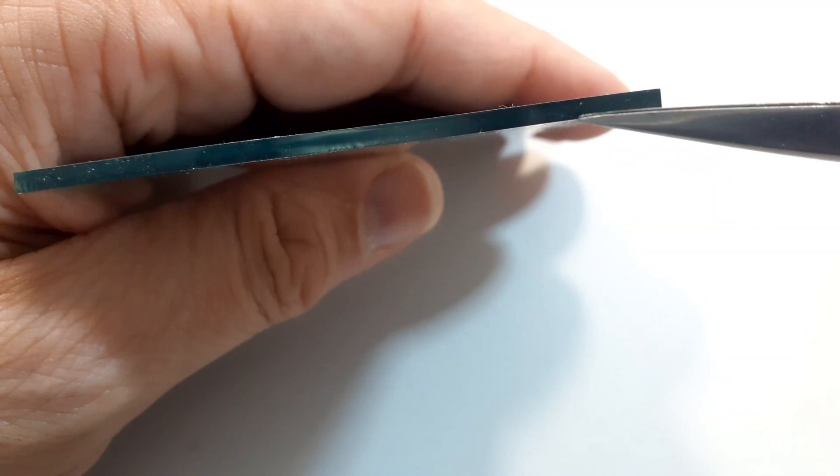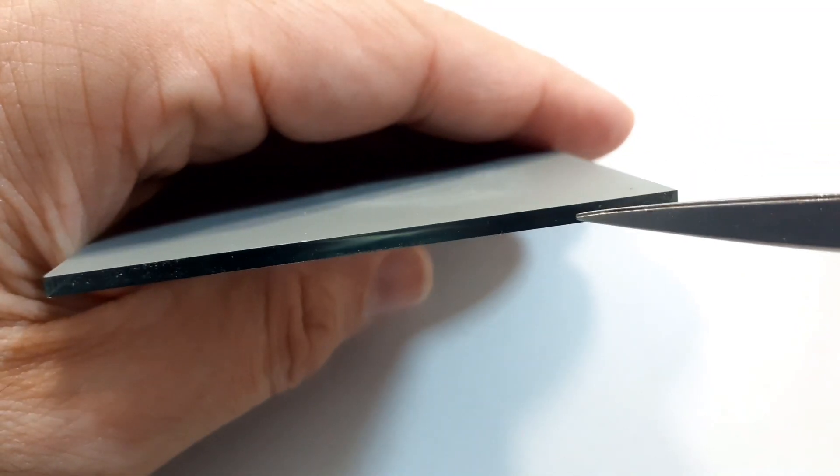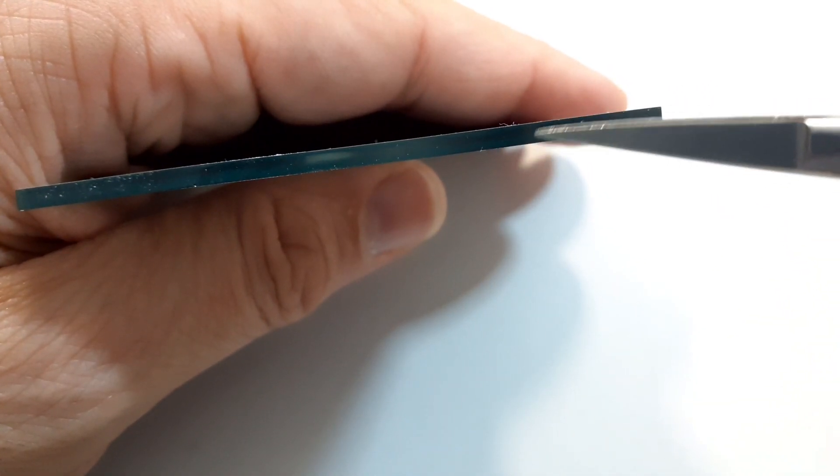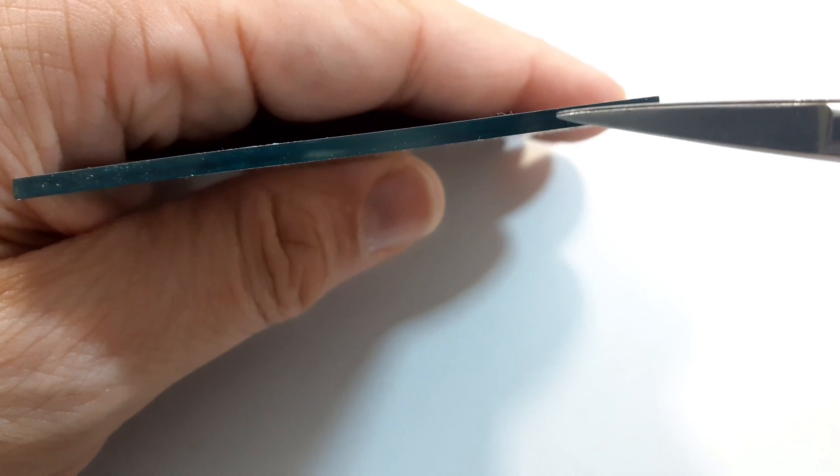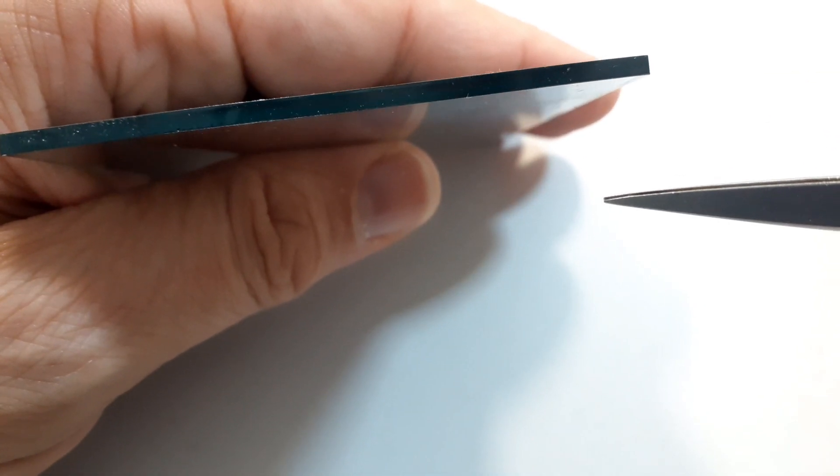So the dot is not very sharp and clear anymore. So you lose resolution this way. This is because you've got light bouncing back and forth also within the mirror because the mirror itself also has a few millimeters of thickness and the light can bounce back and forth between the surface, the metal surface and also the front surface of the mirror.